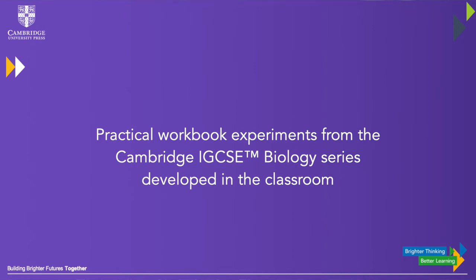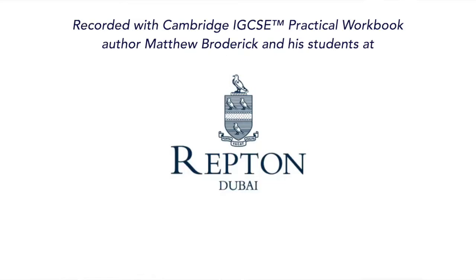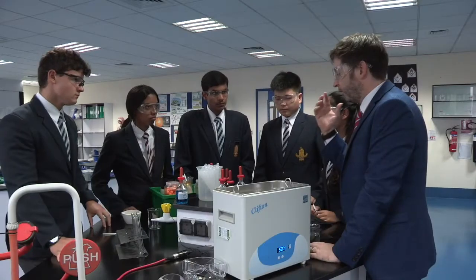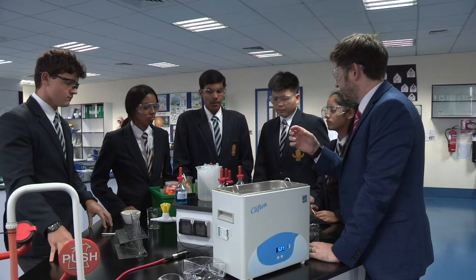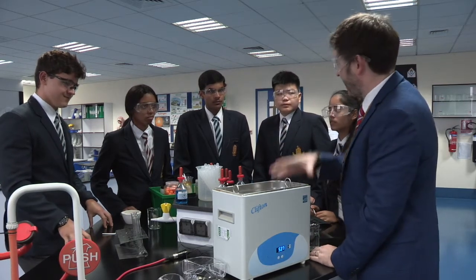Right then guys, we are going to test for reducing sugars or glucose in some of these foods. So which solution do we need to use for this? Benedict's solution, added with a bit of heat.